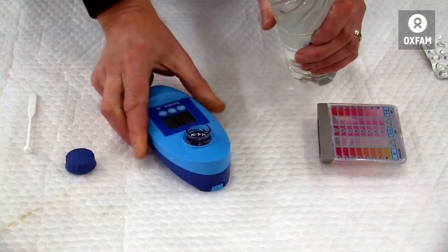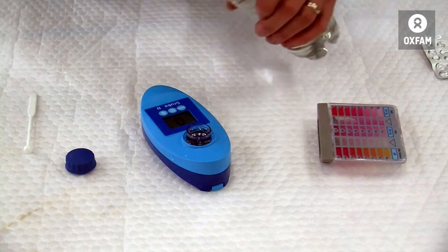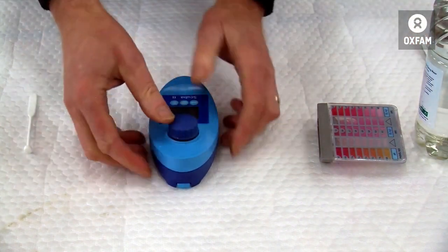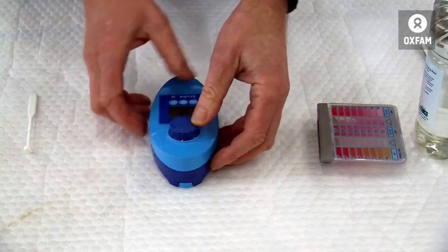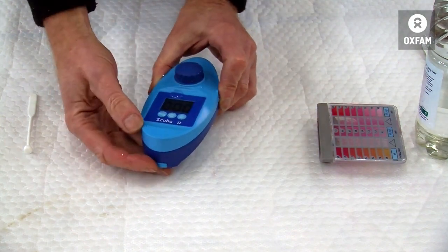Oh, sorry, it went out of shot. Just has to be slightly above the level of the body of the photometer in this one. To calibrate the machine, we use a plain sample, close the top so there's no light getting in, and zero the reading there.